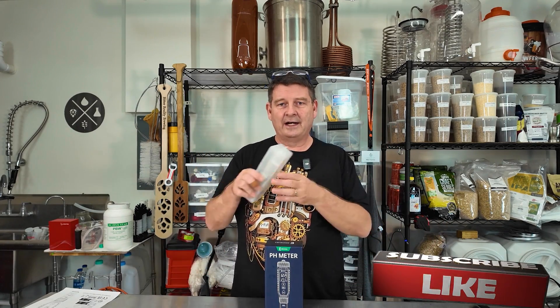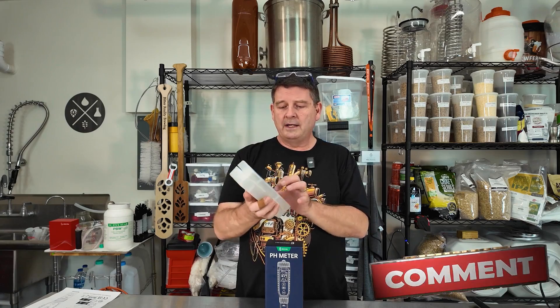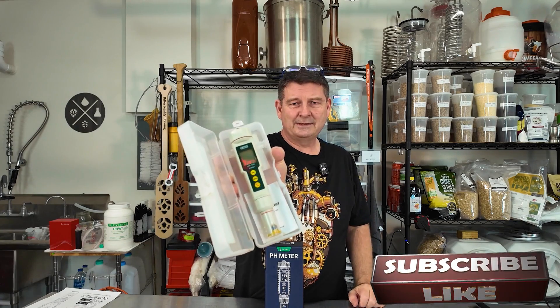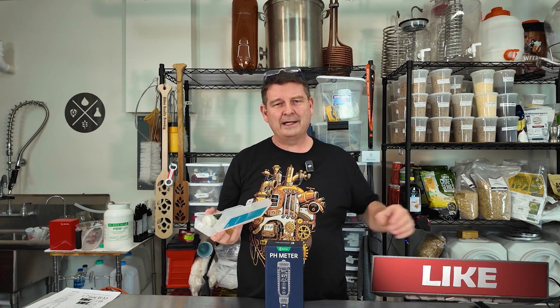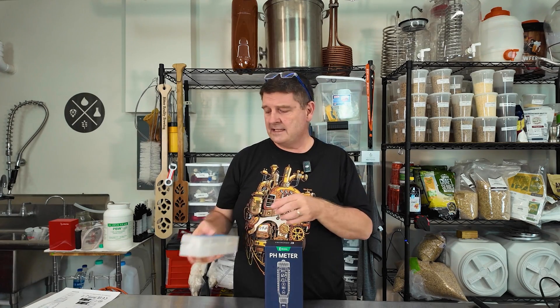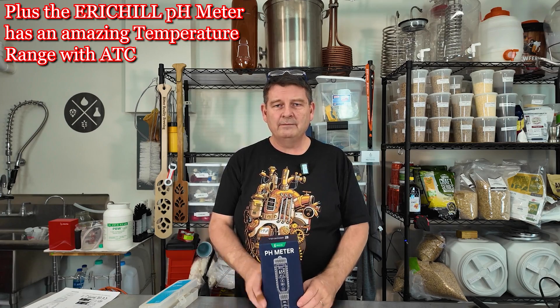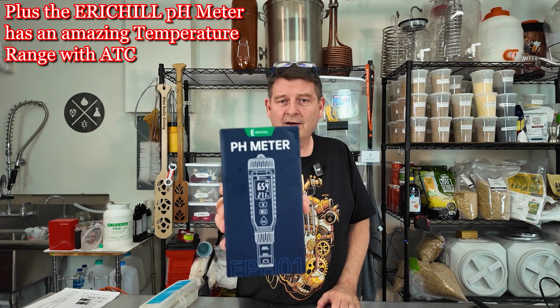So when I was doing the kettle sour I was using my Dr. pH meter, which you've probably seen me use before and talk about in calibration like years ago, but I probably need a new electrode. It's kind of erratic even though I recalibrated several times. It's probably the sensor and it's seen better days. At home brewing you get all kinds of stuff on it. So I was like, man, I really need to buy a new pH meter. About 24–48 hours later I get an email from Eric Hill — a pH meter company I trust, great product, awesome reviews — and they're like, great, we'd like to work with you. I'm like, I would like to work with you, and it just worked out perfectly.